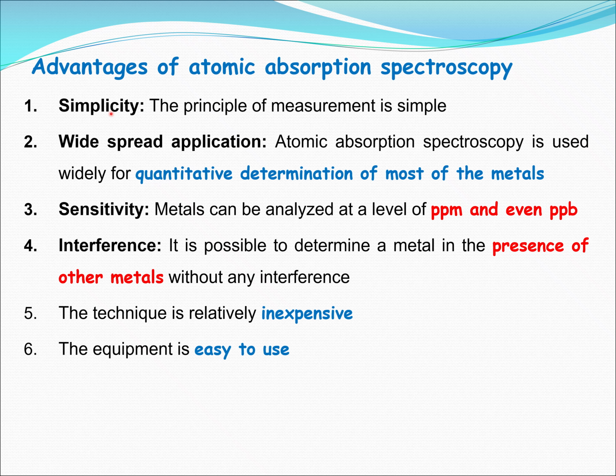This is the overall step-by-step procedure. But in the case of atomic absorption spectroscopy, there is no requirement for dilution, and this is very easy.